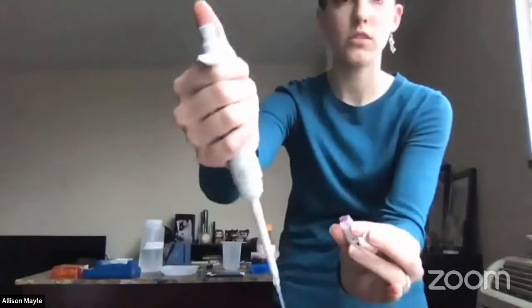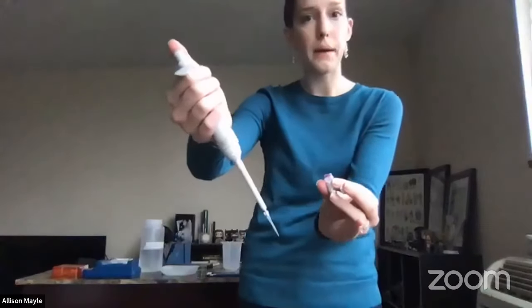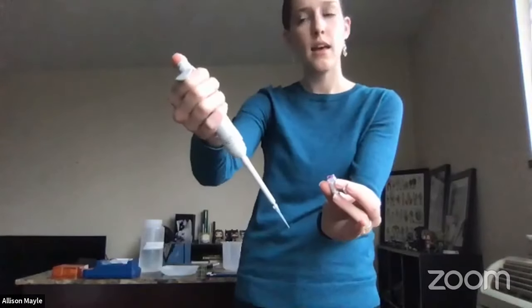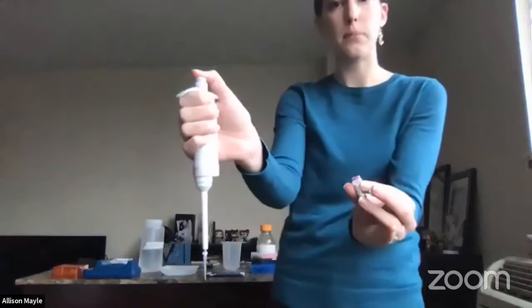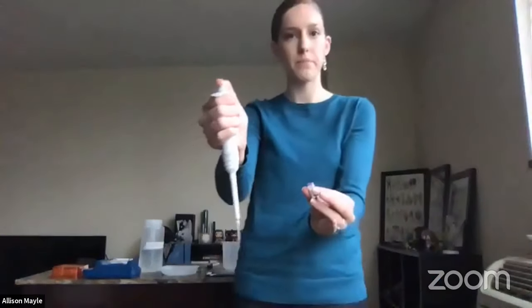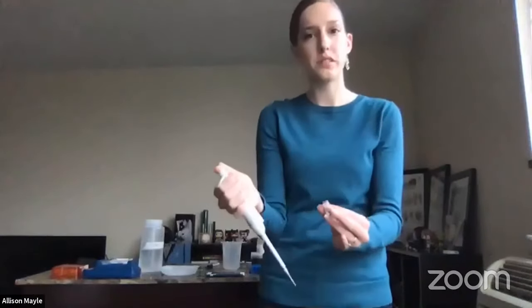So what I would do, just like with the other pipette, instead of squeezing the bulb, I'm gonna press down on the plunger. And when you press down, you'll see there's one stop here, and then you can press down harder, it goes all the way down. That's called the second stop. So I'm gonna press down just to the first stop. That's gonna let out a precise amount of air, a precise volume of air.